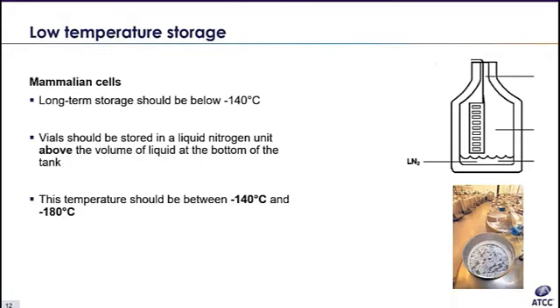It is highly recommended that vials be stored in the vapor phase rather than the liquid. Since metabolic activity is arrested at minus 140 degrees C, the additional cold temperatures of the liquid phase offer no real advantage. However, immersing the material in the liquid phase runs the risk that some of the liquid nitrogen could penetrate the vials and cause them to crack or even burst.